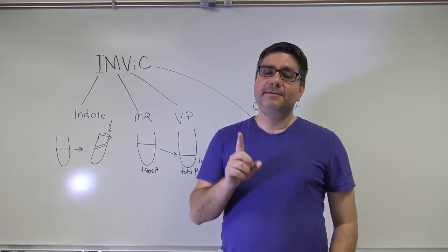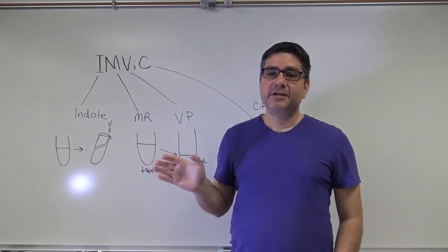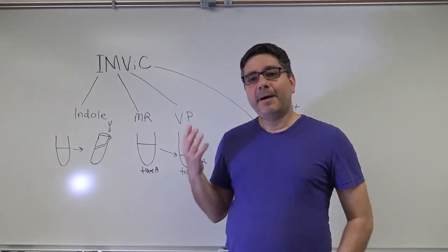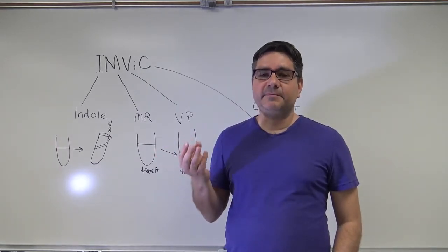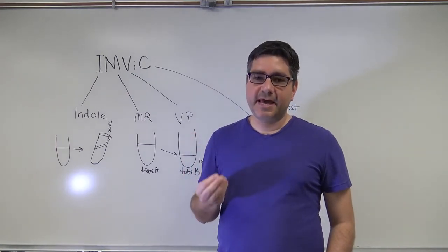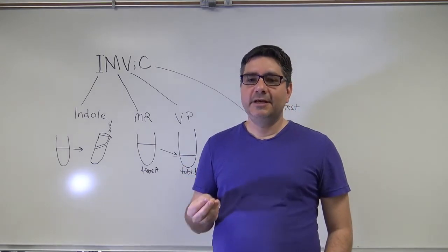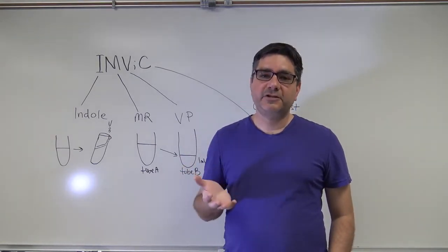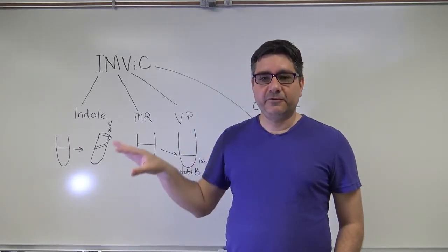Gas can be detected by examining the butt of the tube. Sometimes you may see a few different ways this is exhibited. The medium might be raised, cracked, or split completely depending on the amount of gas produced by the organism. In order to view an accurate result of this test, you should check it after 1 day of incubation. TAs should set these tubes up in separate racks for their section so that I can easily remove them from the incubator and refrigerate them.